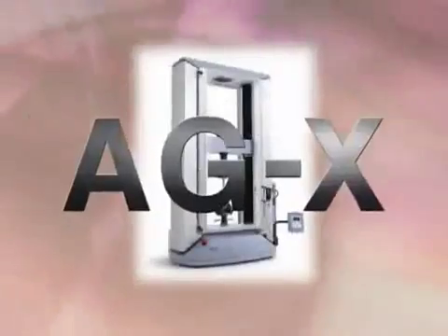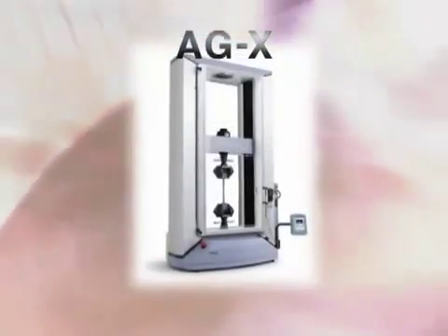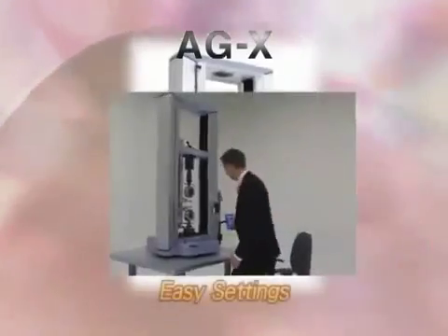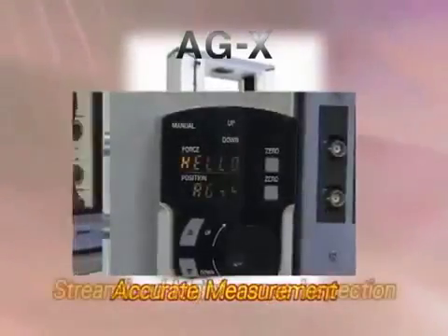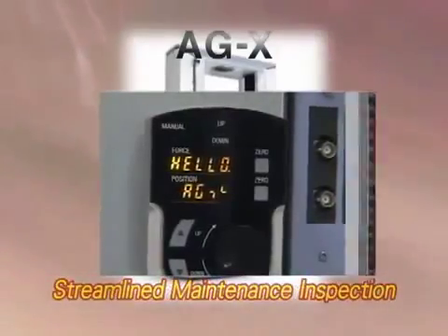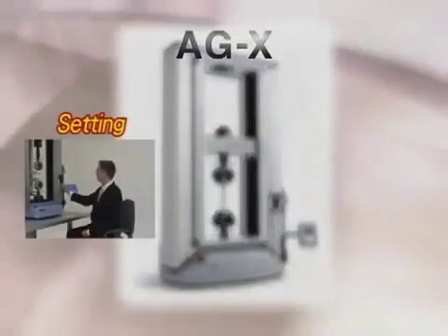Introducing the new generation of Shimazu Autograph Precision Universal Testing Machines. This new line of Autograph Testing Machines is named the AGX Series. Vital testing machine processes — easy setting, measurement, and maintenance inspection — have been completely upgraded and made easier, more accurate, and more efficient.